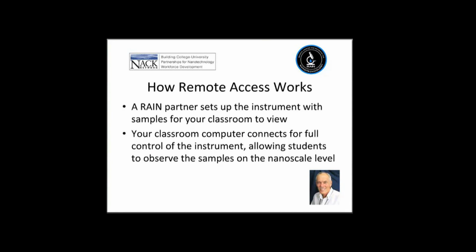How does this work? As a person requesting access, your RAIN partner is going to set up the instrument with samples for your classroom to view. Now, it either can be samples they have on site, or as we just discussed, samples that you'll send in. Now, your classroom computer is going to connect for full control of that instrument. That means your students are actually going to be using their mouse to drive the instrument. They do this in real time, so it's pretty exciting.